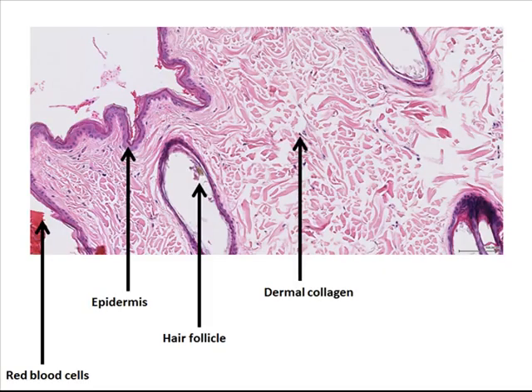Here we have a different case now. This is a section of dog skin and various things that I'm pointing out to you here. On the surface of this skin there's been some hemorrhage where this biopsy has been taken, where this piece of skin has been taken. So this red staining material here, these are red blood cells that are sitting on top of the skin here, and there's some more up around this area here and here.